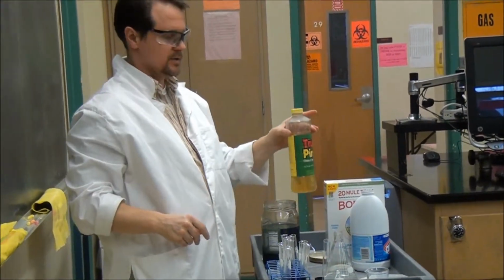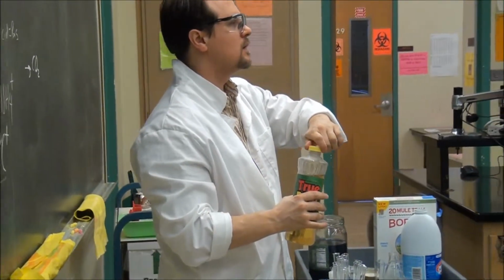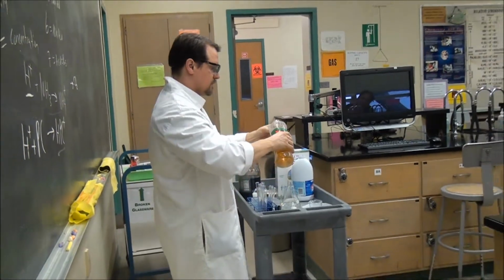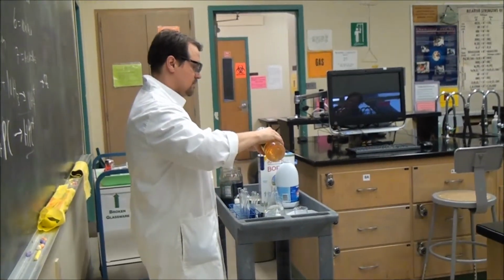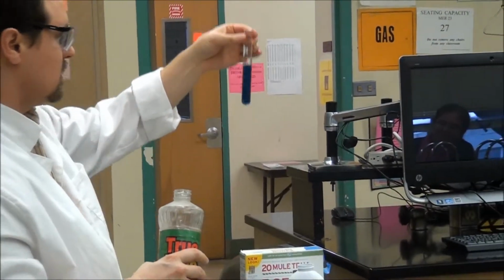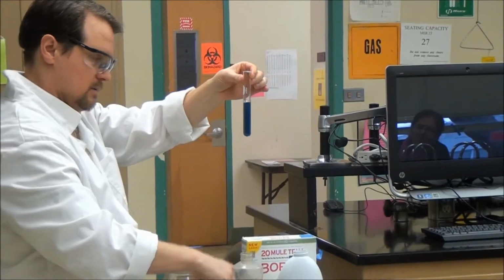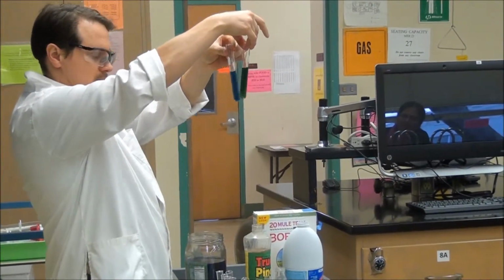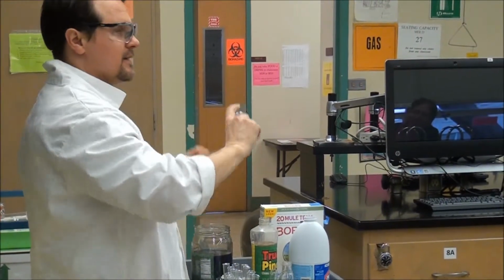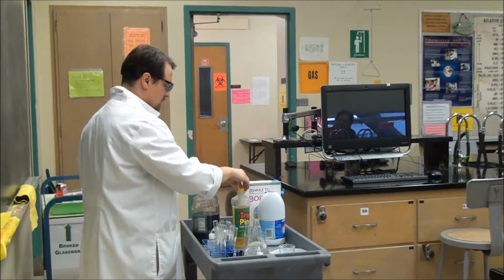So you guys, you want to try pine salt? What do you think? Take a guess. You have to guess. That's part of the game. Base. Okay, let's check it out. You guys are right. Not as strong of a base as the sodium hydroxide, though, right? Okay. But that's the kind of idea. I'm kind of eyeballing, adding equal volumes of cabbage juice and the compound I want to test.